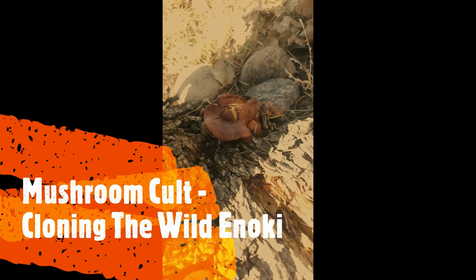Welcome to the Mushroom Cult video series: cloning the wild enoki. In this video we will collect and isolate live tissue from a wild mushroom, and using petri dishes, time-lapse video, and laboratory video, you'll be able to see the entire growth process as well as all the laboratory procedures involved in cloning a wild mushroom.